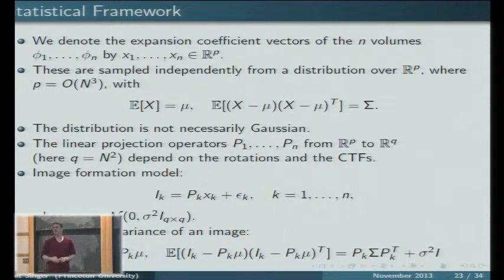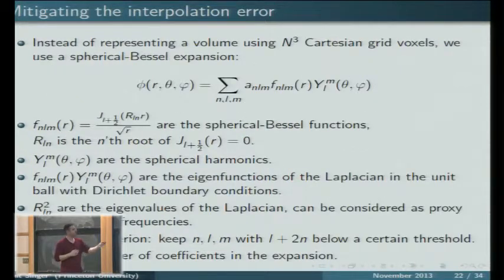But how do you compute the potential from a given molecule, from a given orientation? You know, the charges in some sense, so at the end I'll get phi in this way. If you really want to find the location of the charges, then you have to invert the Poisson-Boltzmann equation, but we'll not do that here. I'll just find the electric potential, and this will tell me where the charges are.